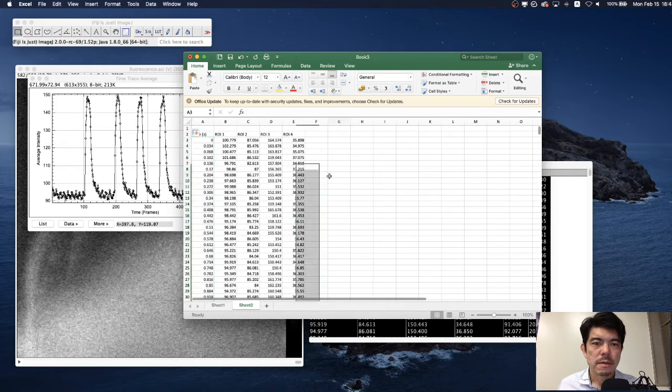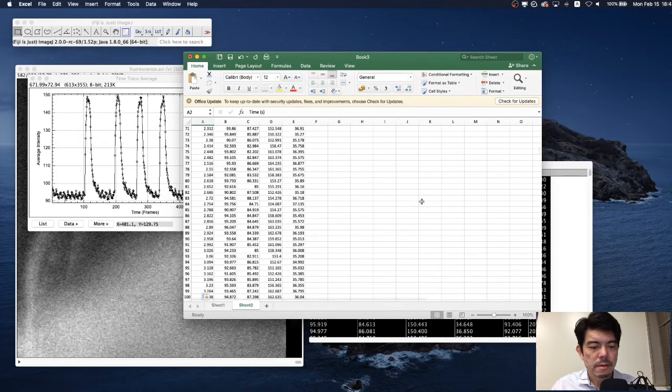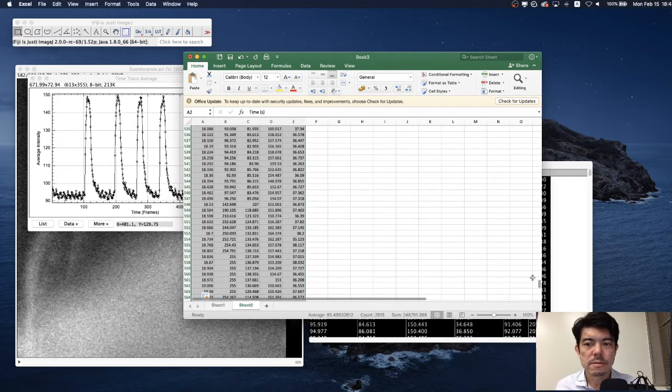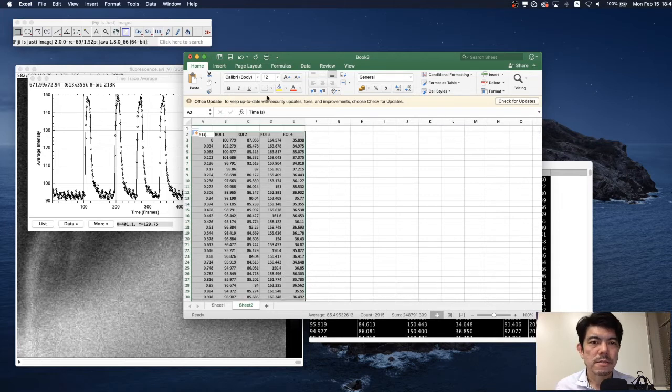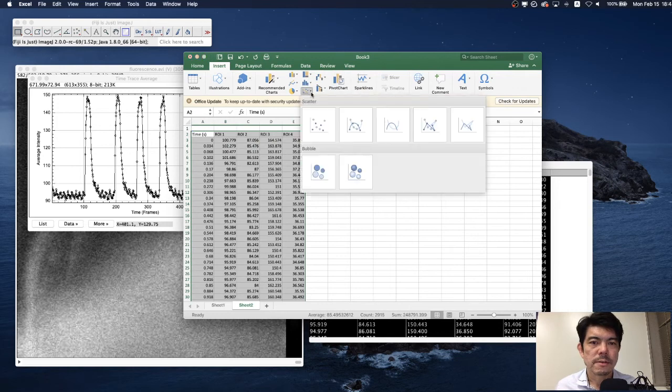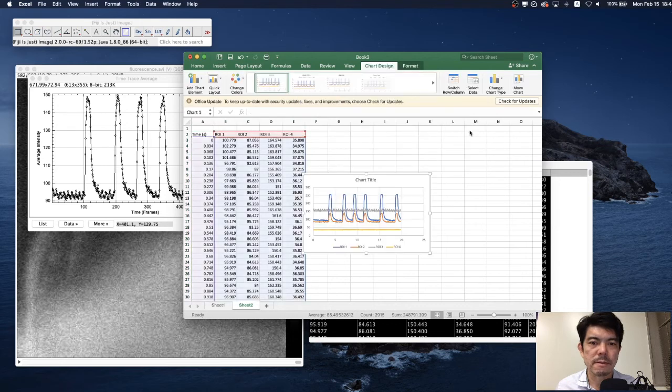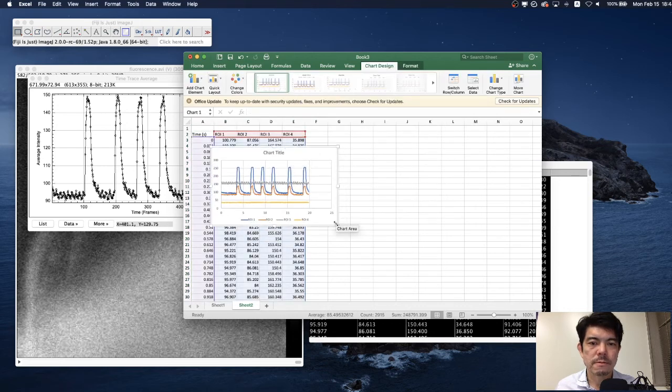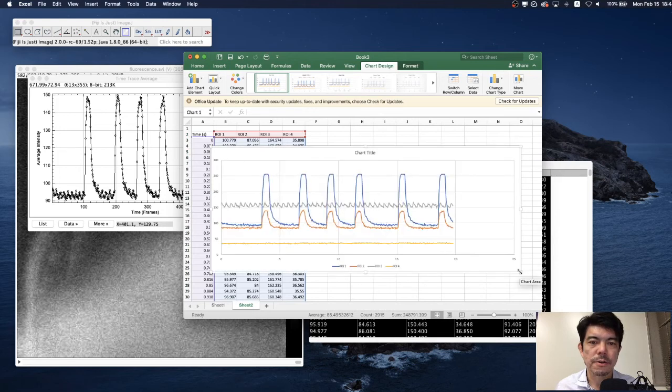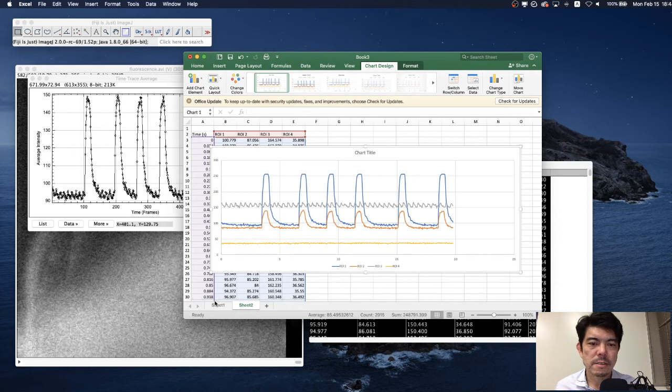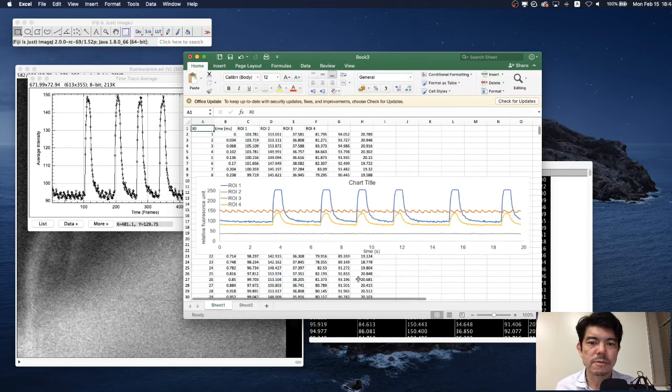We are going to create the nice graph using this time series data. Insert graph and choose the scatter plot and choose this graph type here. And you obtained the nice curve like this.